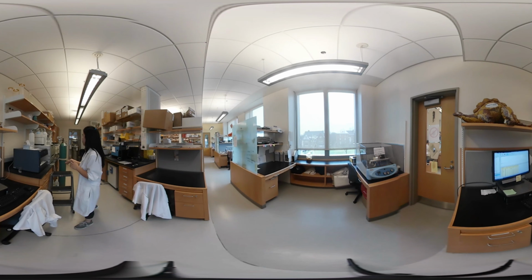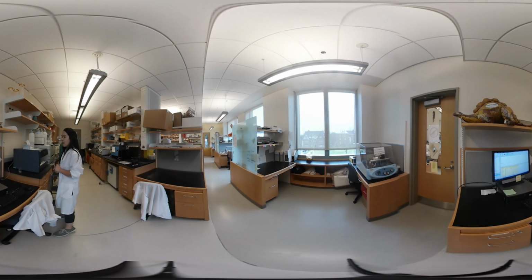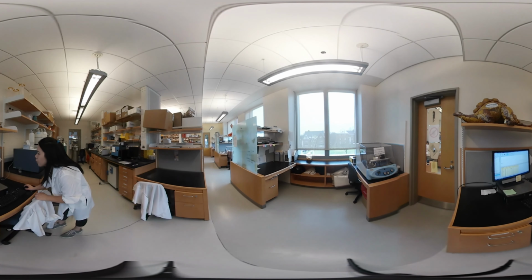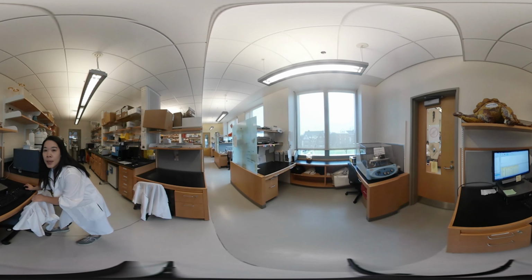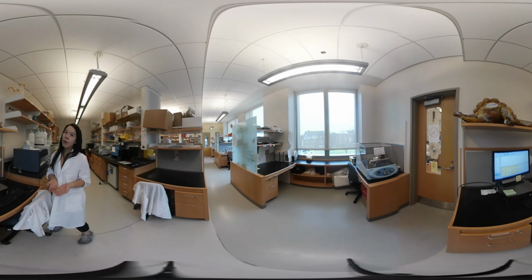So we will use this machine. It's called ion exchange chromatography, and it will test each sample and generate this figure. And you can see each peak is the amount of glucose. Then we know how much glucose is released from the sample.